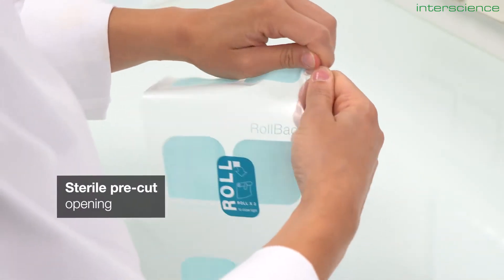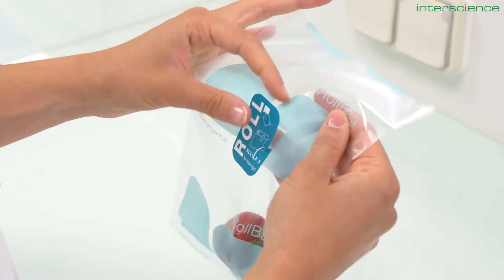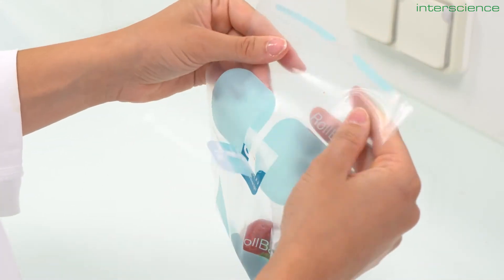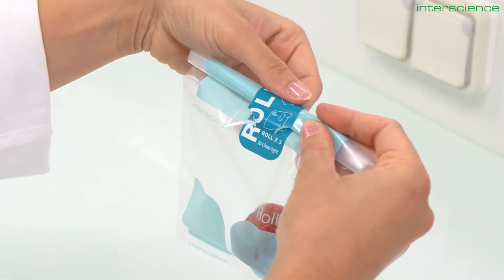Each bag is gamma irradiated for a contamination-free analysis. We developed a new system with a closing sticker that guarantees water tightness and ease of use, while remaining metal-free.